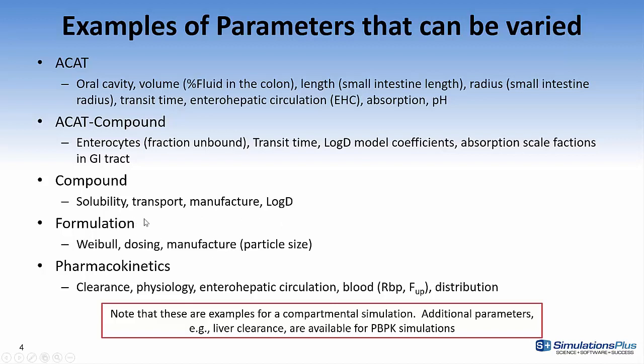If you're using formulation, you can perform the sensitivity analysis on Weibul function, dosing, manufacture, in other words the particle size, pharmacokinetics such as clearance, physiology, enterohepatic circulation, blood, which is a ratio of blood to plasma, and fraction unbound, and distribution can be modified within the interface.